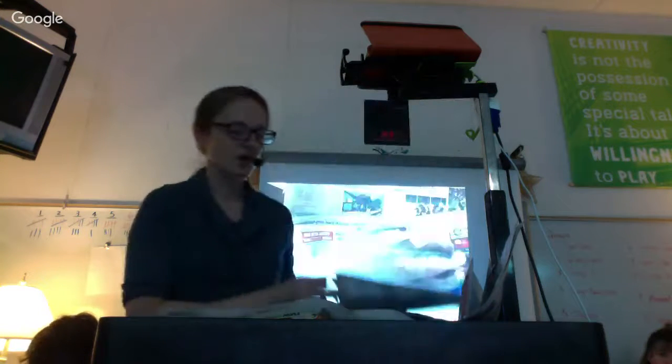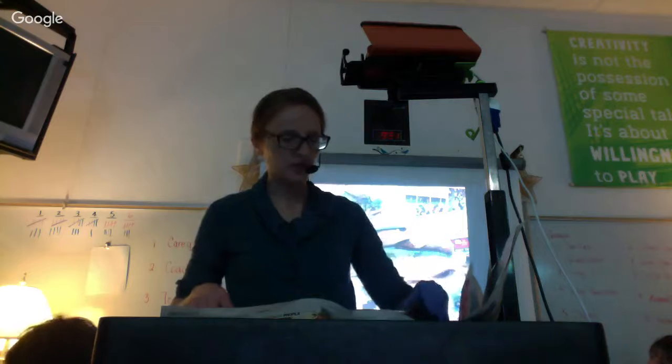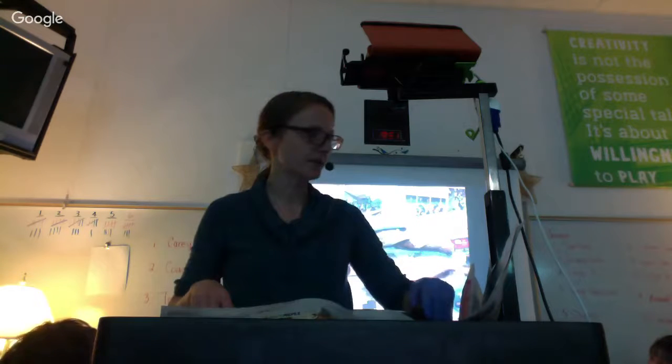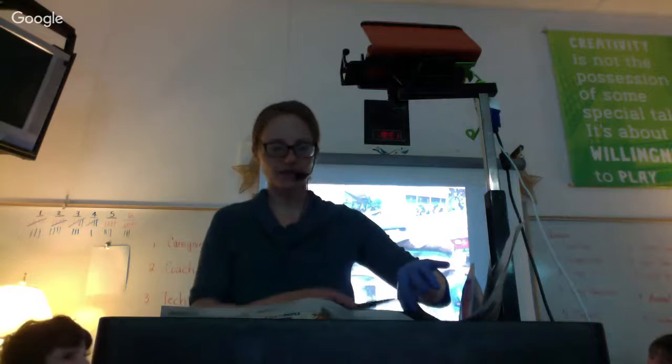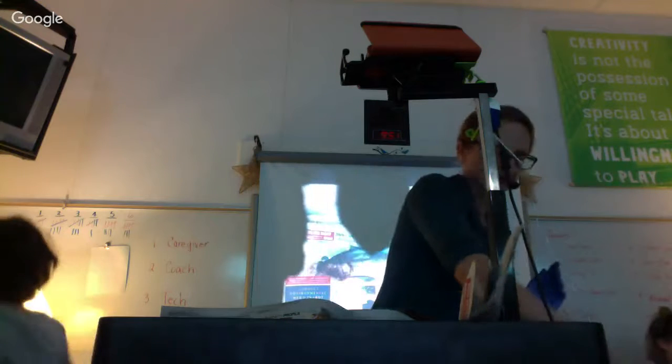Okay, so what we are going to do now is we are going to pull this back. Now you will see the gills right here. The adult is going to take the knife and is going to be cutting out the gills and the four arches. Okay, so everyone can do that now. I will come to your eyes shortly.